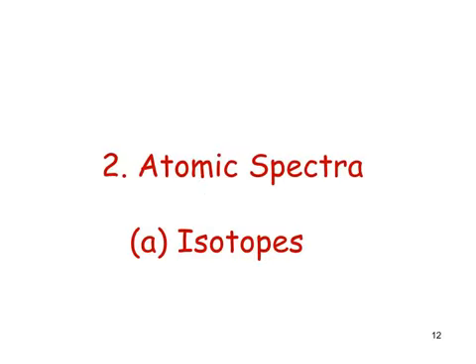We've spent now just over 20 minutes looking at the design of a mass spectrometer, and I think that was not only worthwhile but necessary. I can't see how it would be good for a student just to get started in with interpreting spectra. Having said that, that first 20 minutes is not going to be tested in much detail. You should have a basic outline of those 4 stages we've just looked at.